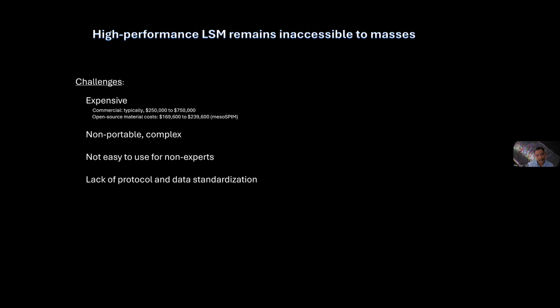Light sheet microscopy is still not easy to use by non-experts like clinicians. It needs some understanding, as opposed to confocal or slide scanners, which have become more or less push-button systems with full automation. With light sheet microscopy there's a barrier on usage.